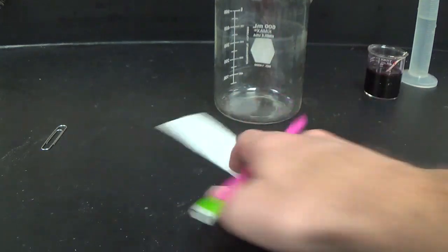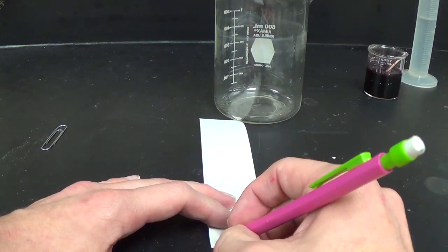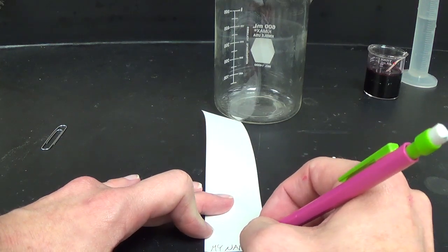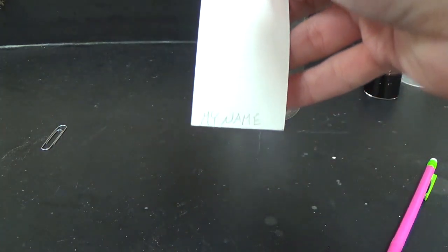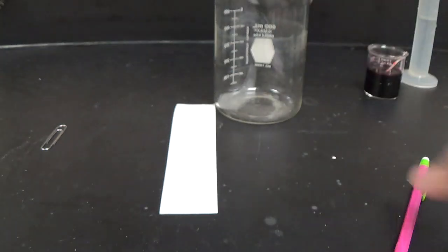Now also on the other side, so I put pencil mark there, on this side is my name. Okay, so I wrote my name on this side. Get it? It says my name. Okay, literally. So I've got my name on this side. There it is. And I've got the pencil mark on this side as a starting mark. And I'm going to now place my sample mixture on my starting mark.